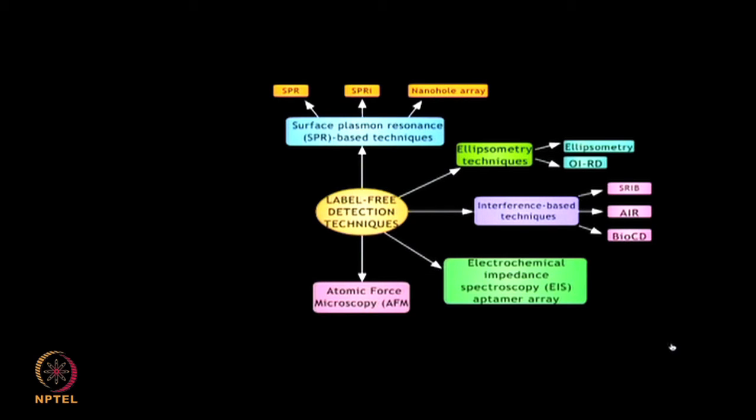Atomic force microscopy, AFM, the vertical or horizontal deflections of cantilever are measured by high resolution scanning probe microscope, thereby providing significant information about surface features.